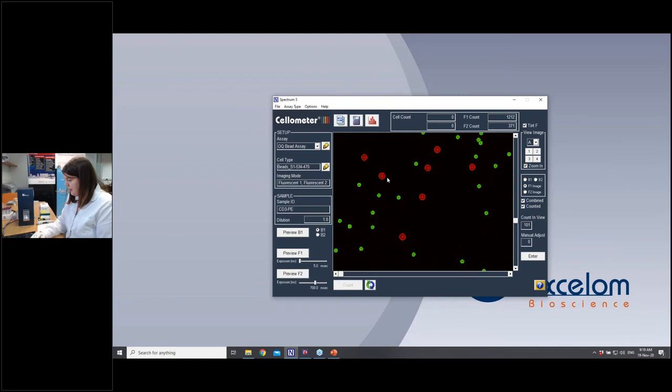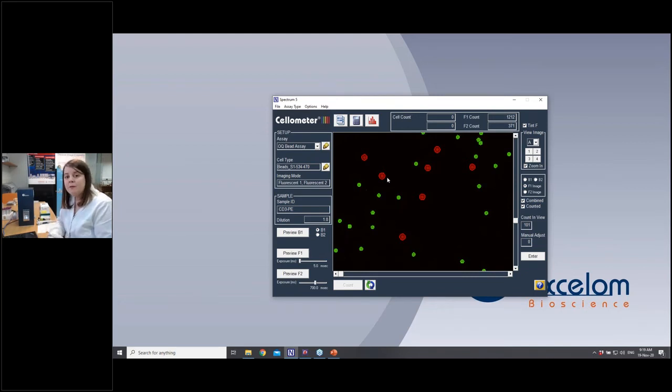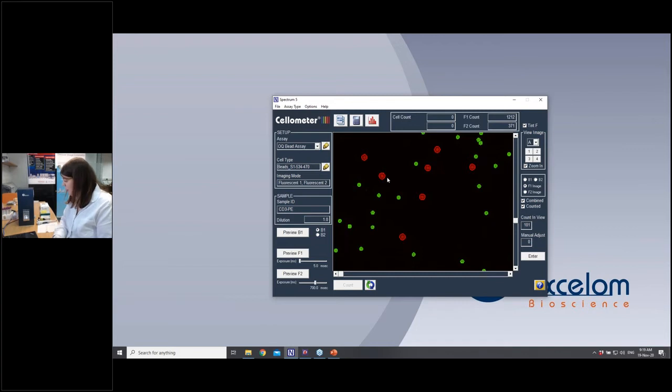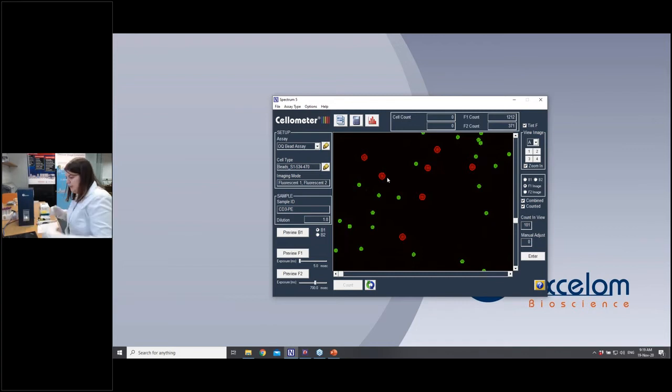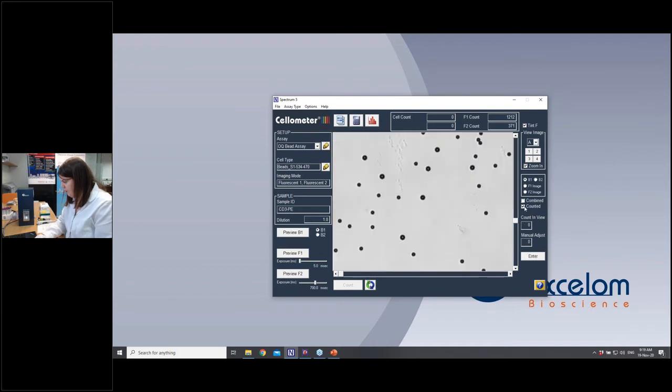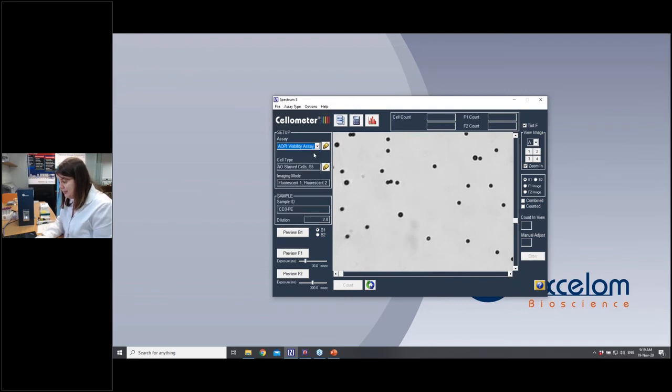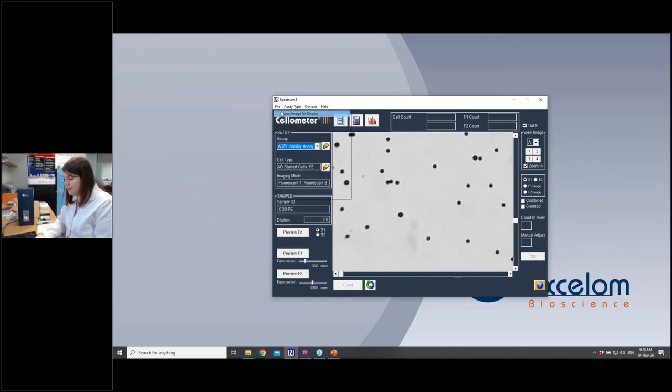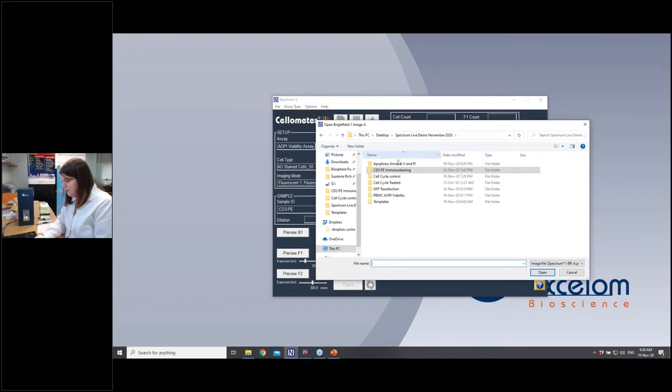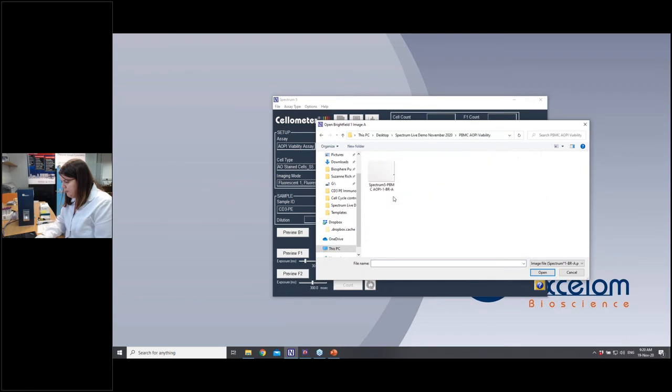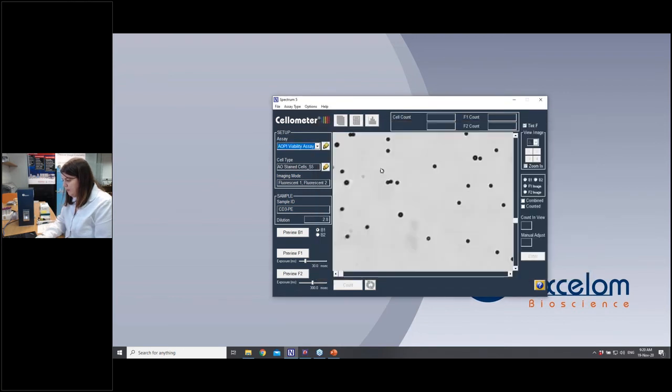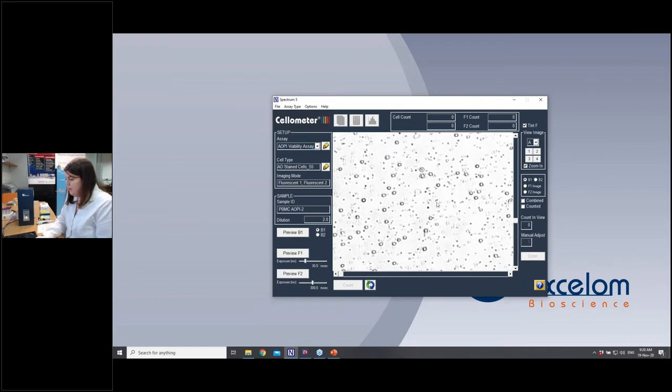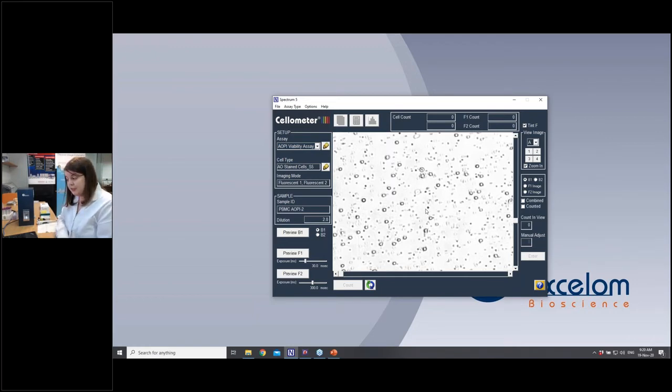Okay, so with that, I wanted to now show you an example of viability, an example of some of the simple cell-based assays we can do as well. I don't have any cells with me today, but I have some previous images that have been taken that I can show you. So I'm just going to remove that slide for now. And we're going to first look at a viability sample. So I'm going to choose my AOPI viability assay and I'm going to load some images. So we have some PBMCs that I will load up.